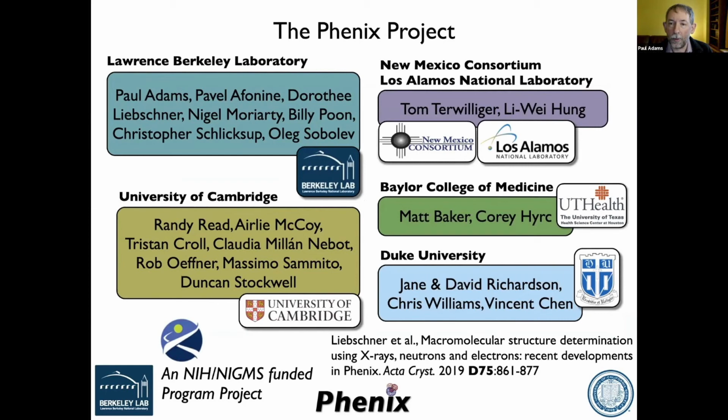Unrelated. Okay. I was working with a 4 to 5 angstrom medium resolution map. There, the clash score was really in the range of 30, 40, and I was trying to reduce it by trying many options. One thing I tried was playing with the weight while doing the refinement. First I tried the default parameters, but it was again in the same range.